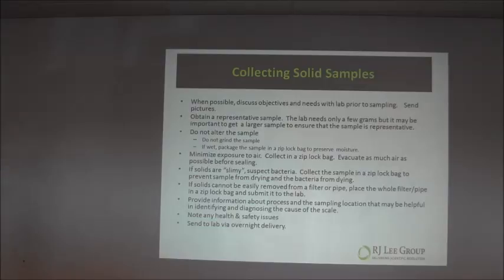the sample. If you would note any health and safety issues, if there's chemicals that might be present on a scale, let us know that. If the scale might be radioactive, certainly want to know that as well. And then again, send it overnight. Don't throw it in your pickup and haul it around for a week, and then drop it off, as it might be a different sample at that point.